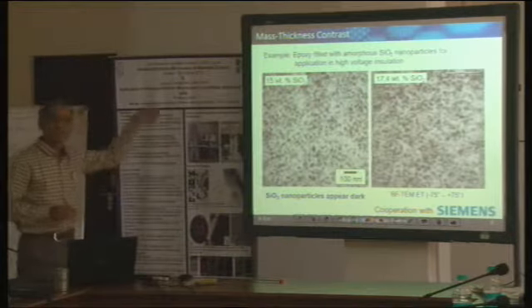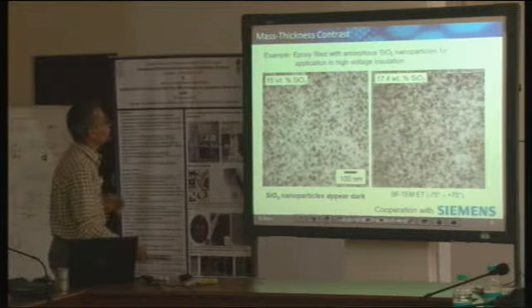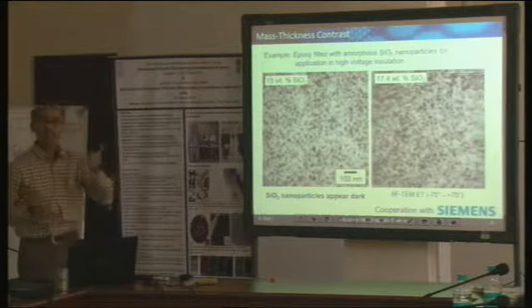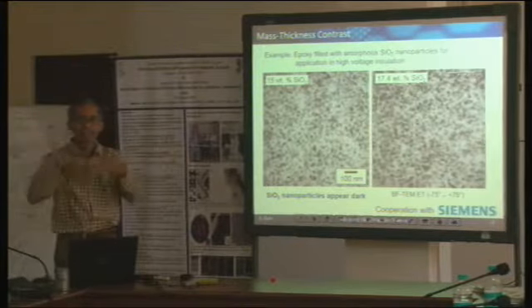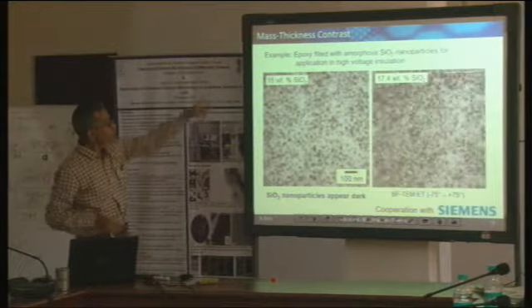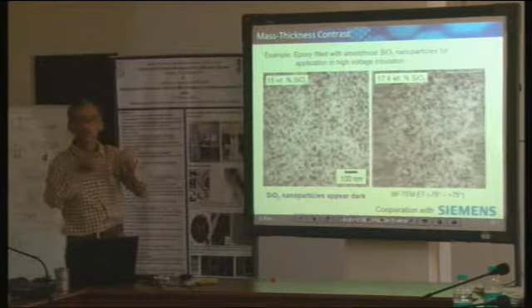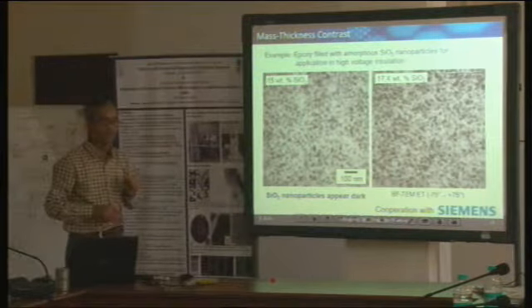Now that was an example from, let's say, biological sciences, and this is one example wherein we have, let's see what the sample is. The sample is epoxy filled with amorphous silicon dioxide nanoparticles. Now epoxy, as you know, is some kind of polymer. Of course it has to be amorphous, correct? So the matrix is an amorphous material, and then inside that are silicon oxide nanoparticles. Those are also said to be amorphous. So we have amorphous material as matrix and amorphous material as nanoparticles or inclusions in it. That's our material composition, and we make a bright field image out of it.